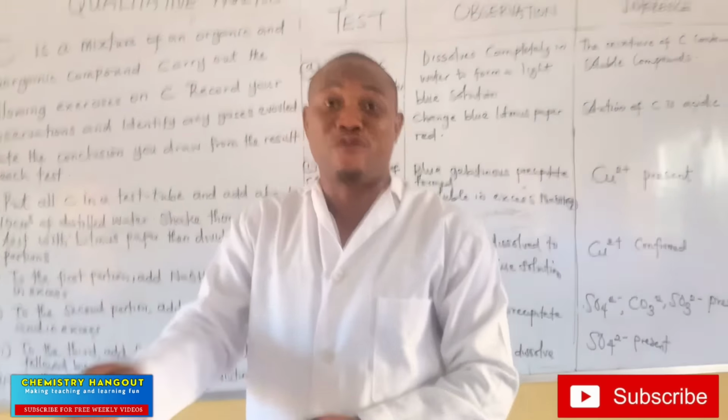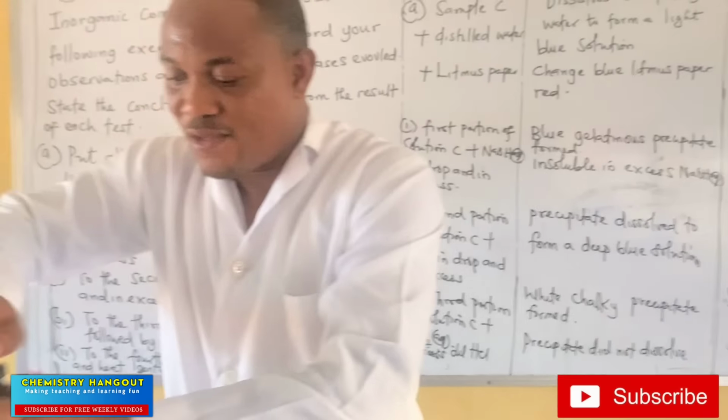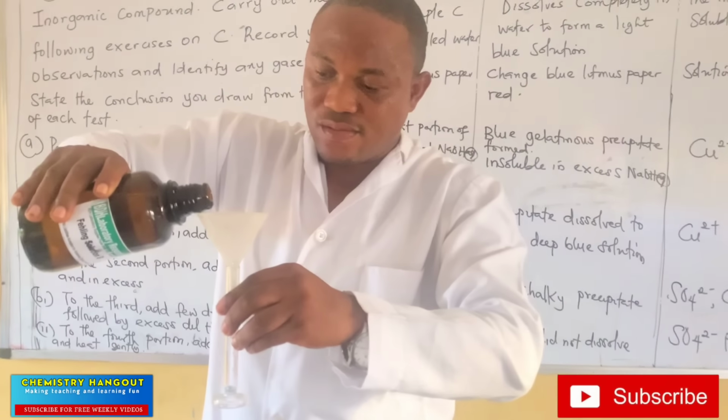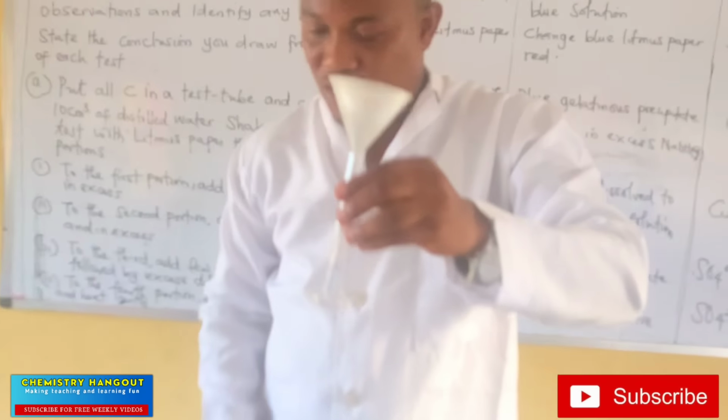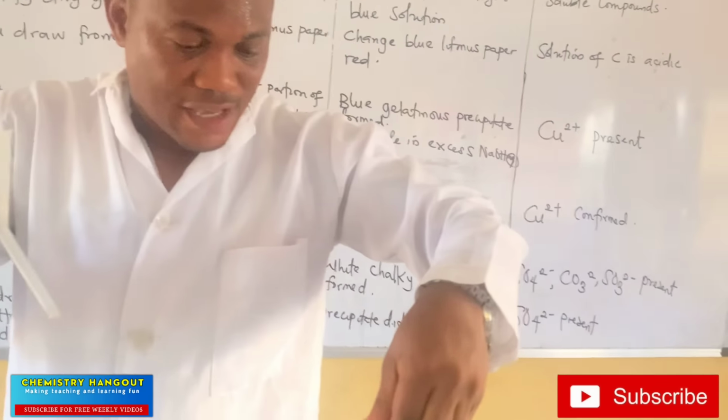Then that's A. Then the B now. Fehling solution B, 2 centimeters also. Is it 2 centimeters? Oh, this is much. Let me read, because I said same measurement, please. Same measurement.